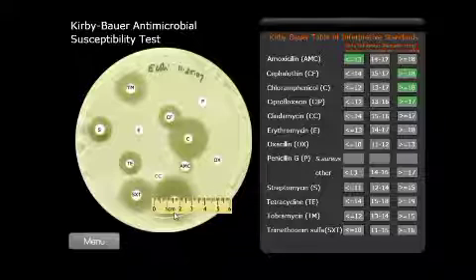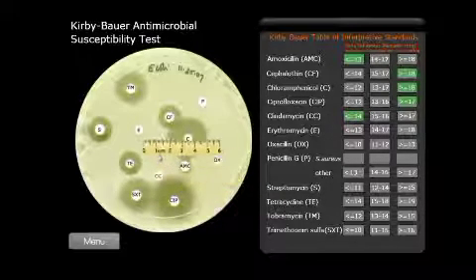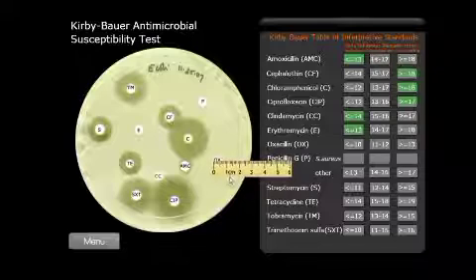CC, 7, which is resistant. E, 6, which is resistant. OX, 7, which is resistant.